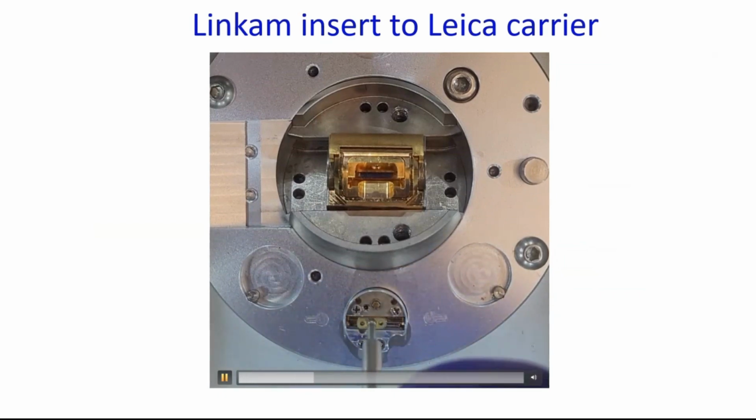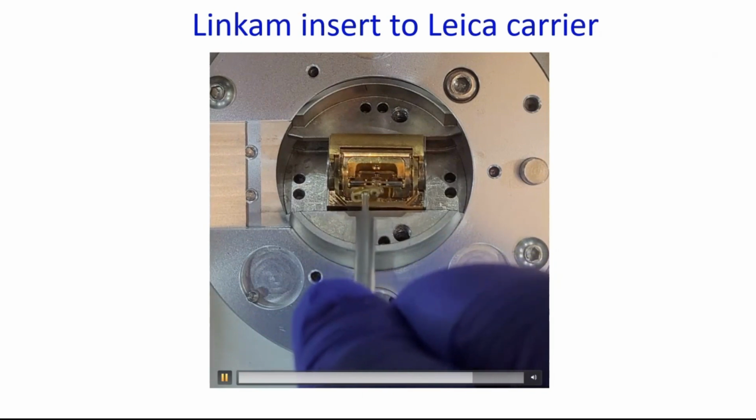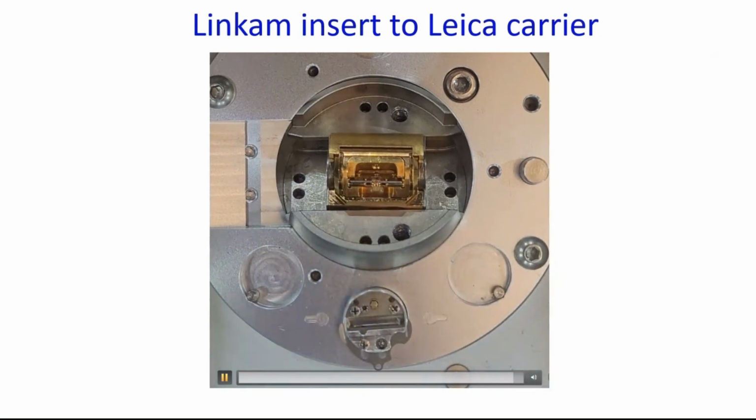You go in with a magnetic tool, you grab it from the bottom, and then you slide it into the Leica holder. And that's it. You're done. Your grid is transferred. You have very little ice contamination, and you've never touched your grid, so you have maintained your orientation. So this made our lives a whole lot easier.